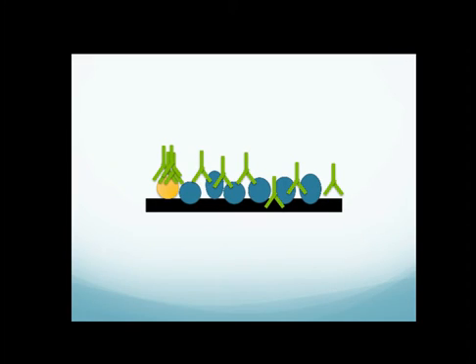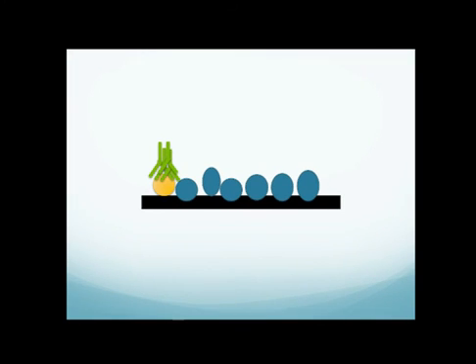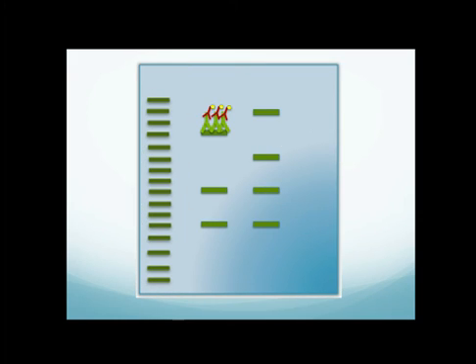Then you wash the membrane with the TBST for 5 minutes, 3 times, to get rid of all the antibodies that are bound to non-specific protein. After removing the unbound primary antibody, the membrane is exposed to another antibody. These secondary antibodies are usually bound to biotin or other reporter enzymes such as horseradish peroxidase, which will bind to one primary antibody and enhance the signal so it could be detected when you image it.